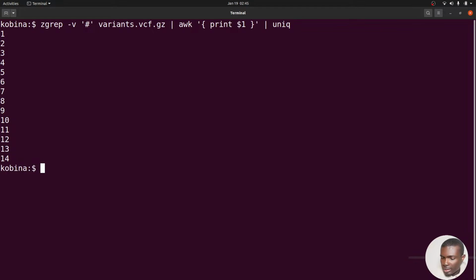Okay, so let's proceed. We will continue. Now, let's say you want to count the number of variants per chromosome, you can also do that here. Let's try it.